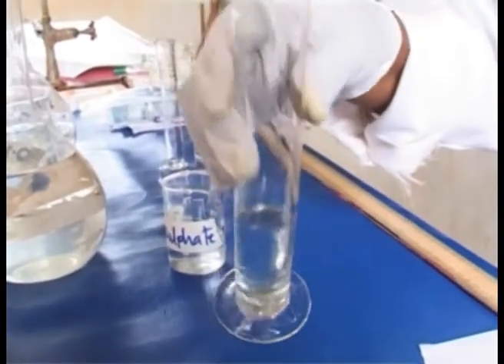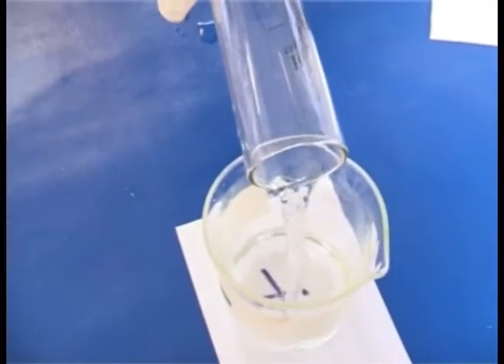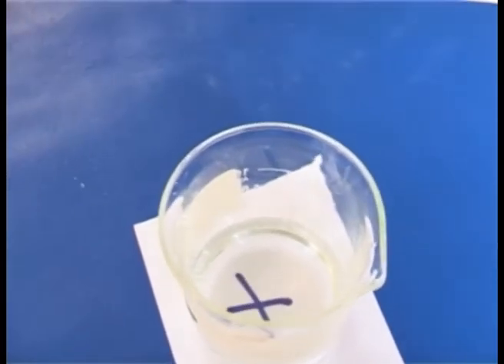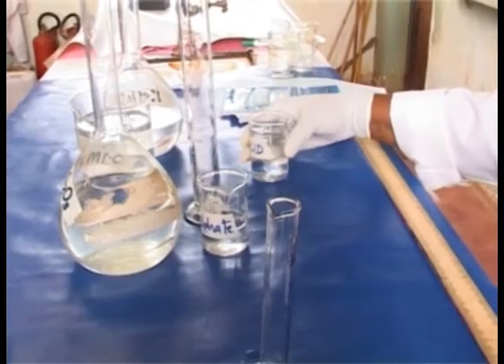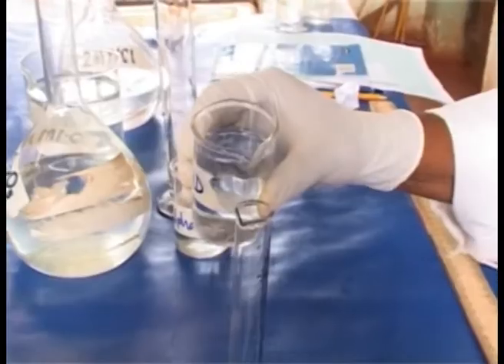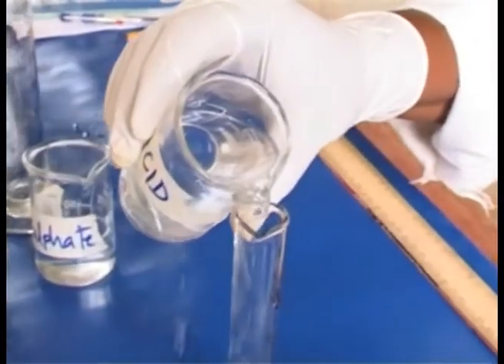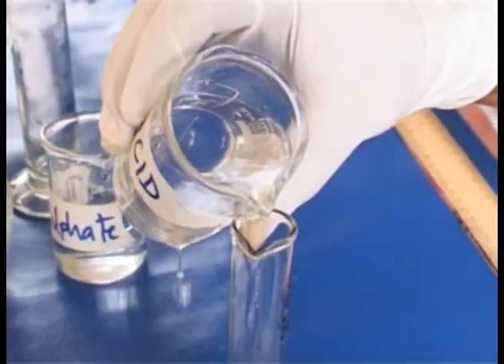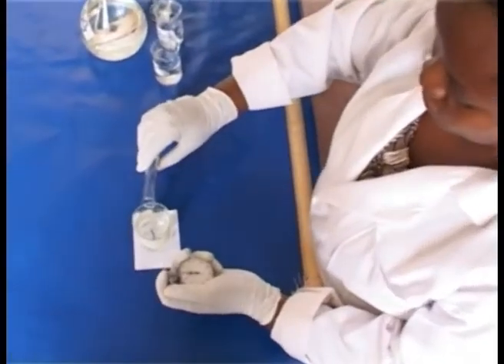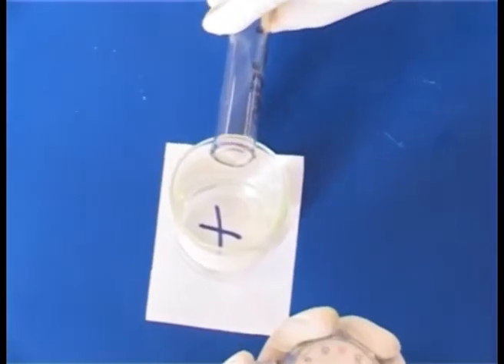Transfer this into beaker L. Take hydrochloric acid and measure 10 mils. Add 10 mils of 2 molar hydrochloric acid. At the same time, start the stopwatch.